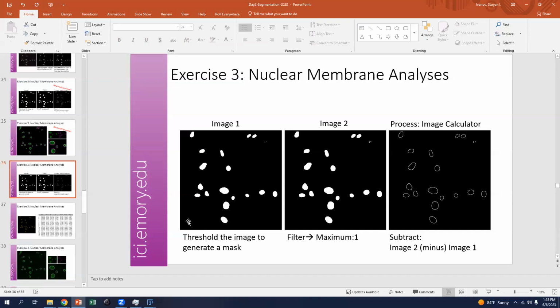So just give that a shot, make sure you get good at that. And then in general, I think what helps is to close out those images in ImageJ as you don't need them, like save them and get rid of them. Because a lot of times what can produce issues is when ImageJ gets confused as to what image you're trying to analyze. So give that a shot.